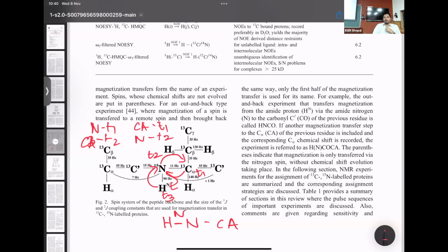One of the questions that was asked in quiz 2 was to make you guys understand, while going from 1D to 2D, yes, you lose sensitivity, but you get resolution. But a more important aspect also is that as you go from 1D to 2D, you're also spending a lot more time to get your data. You have two different chemical shifts that are encoded. For each, you need to do quadrature.